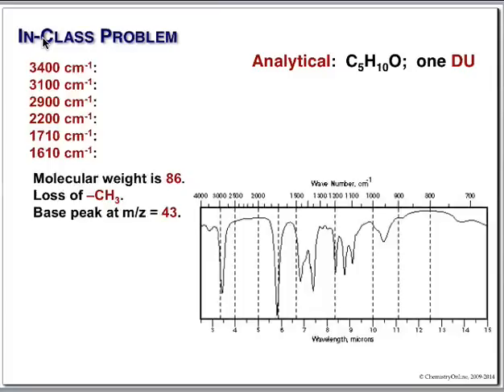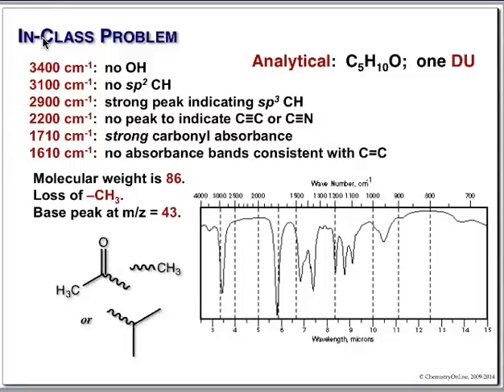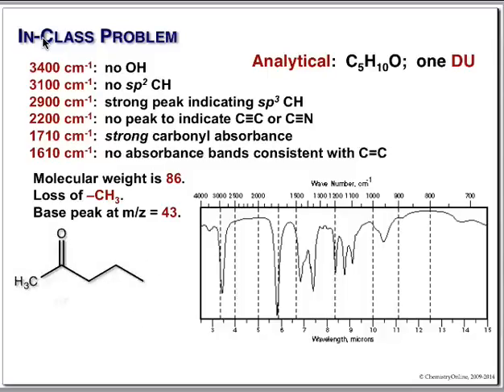When we look at the IR, the big thing here is this ketone carbonyl, no aldehydes. So we're dealing with an acylium ion, loss of a methyl, that's it, and our base peak. Now again, we have to guess, because it could be either of these. But the NMR will tell you instantly the difference between them, and it'll be just as simple as this one is.